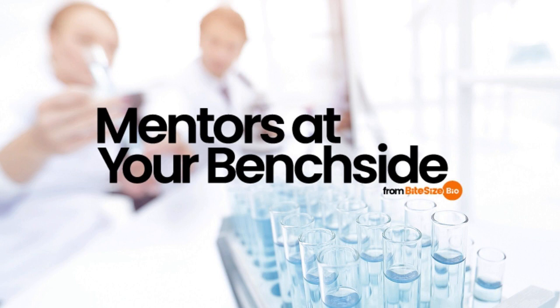We don't often talk about how a technique in the lab may vary from person to person, resulting in differences in the measurements of a single property. To minimize the inherent variability between scientists, ensure that procedures are kept up to date and are as descriptive as possible. In some cases, it might be easiest to have only one person responsible for a given measurement, but I appreciate this might not always be possible. Ensure that all lab personnel are trained, especially on highly manual techniques like pipetting, to maximize accuracy and precision.